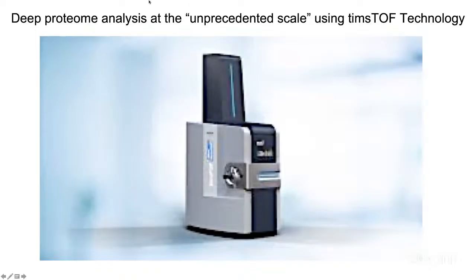And fortunately, at our startup in collaboration with Bruker, we have now acquired this timsTOF technology. I now request our team at Proteomica to share their video and do a live demo to talk about the timsTOF technology, which we think is giving us an unprecedented scale of data.